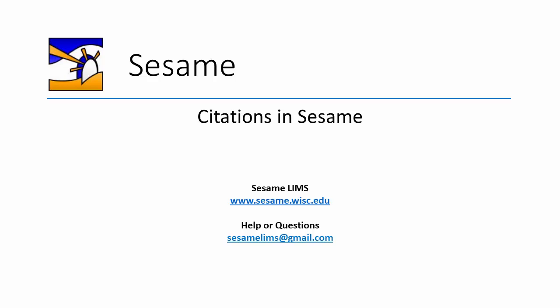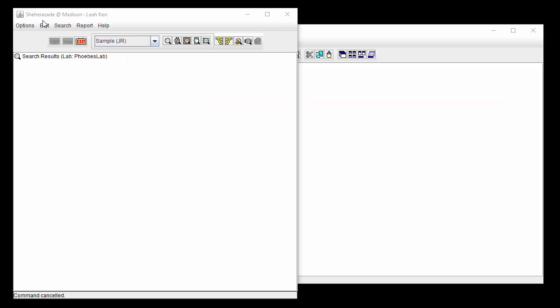Hello and welcome to this video tutorial about creating and viewing citations in Sesame. In this tutorial, we will be working in the Scheherazade module.